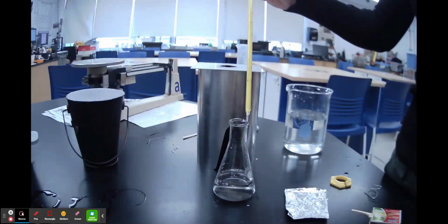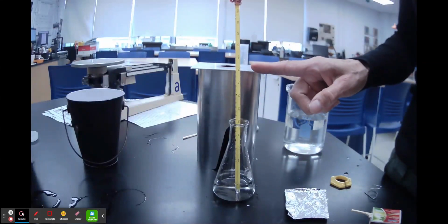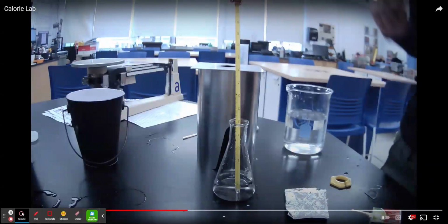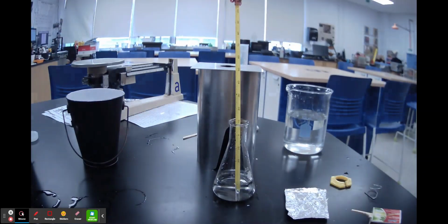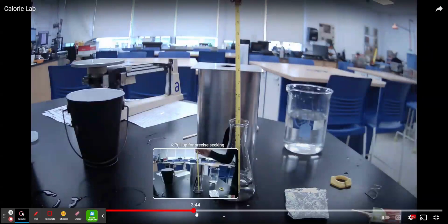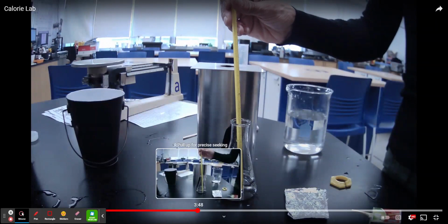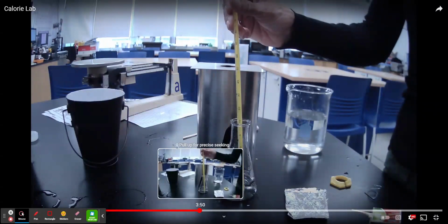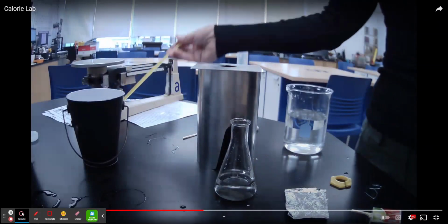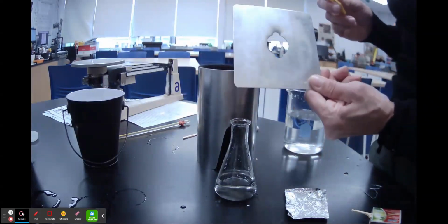And you're going to take the temperature. In your data sheet, you'll record this under initial temperature in degrees Celsius. So if you do have a thermometer that has Fahrenheit and Celsius, make sure you're recording this in degrees Celsius, under initial water temperature. Then you're going to place the thermometer in the protective case so that it doesn't get broken or fall off.